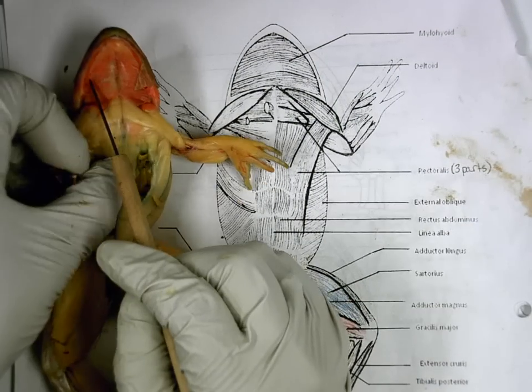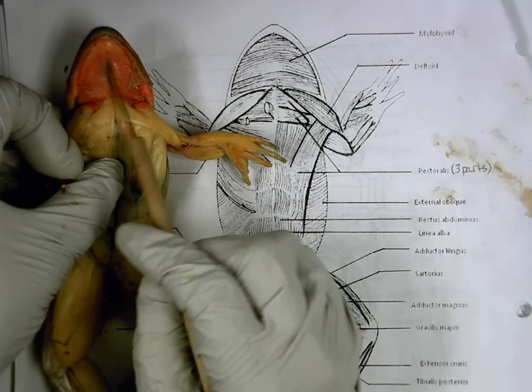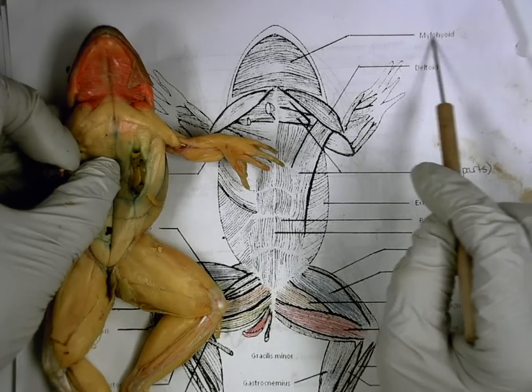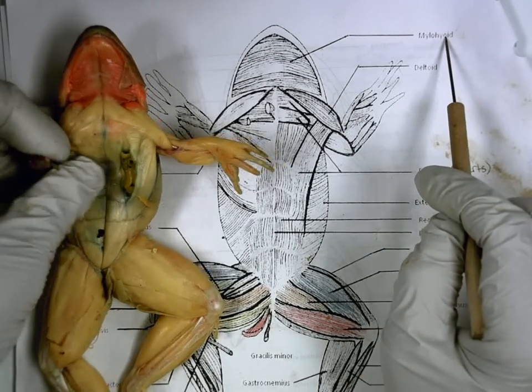Okay, here we go, you guys. These muscles across the chin are the mylohyoid.